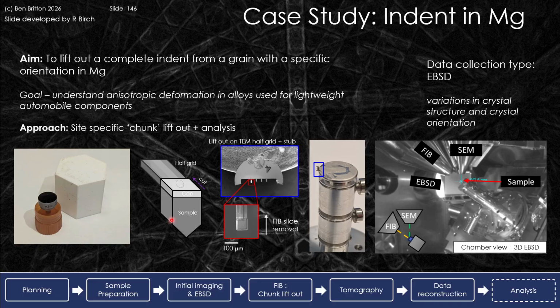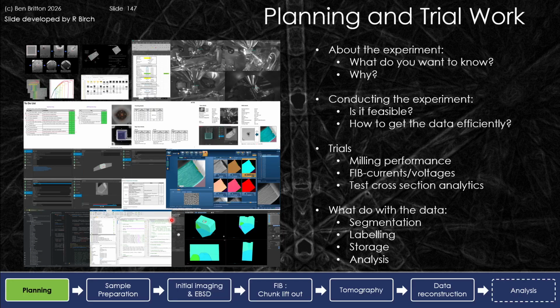And we're going to collect EBSD data is what's important. So one of the pieces that Ruth and I like to point out to people is these experiments are quite expensive in terms of instrument time. And so there's a huge amount of benefit from planning the experiments carefully.